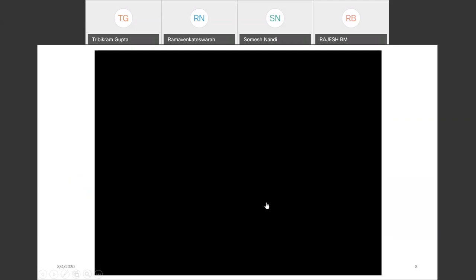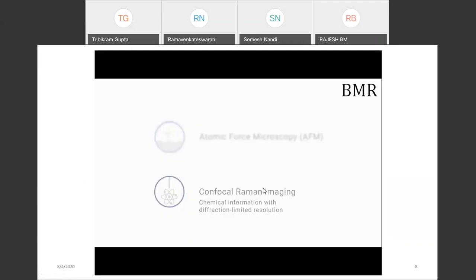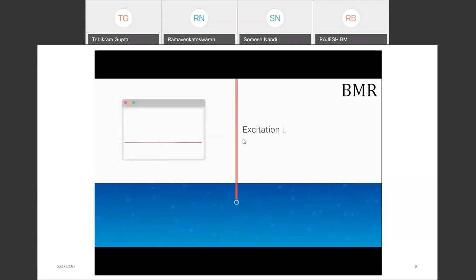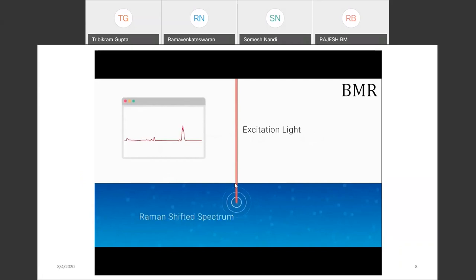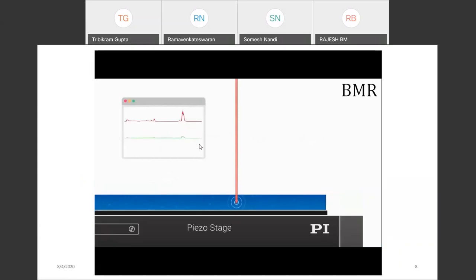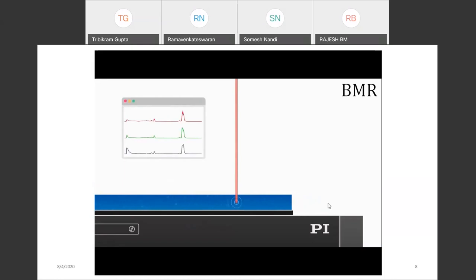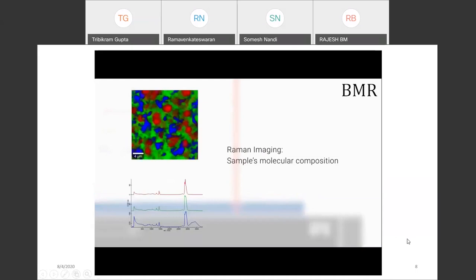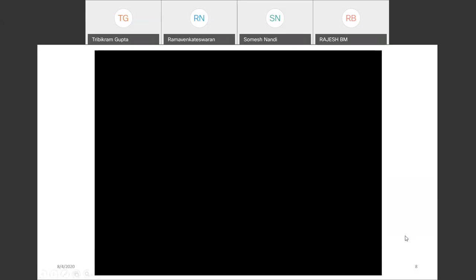I will show a simple video of how confocal Raman spectroscopy is used for depth profiling of the sample. The laser light falls on the sample, and from the reflected backscattered light it goes to the spectrometer and gives the spectrum. From this, the sample composition can be studied.